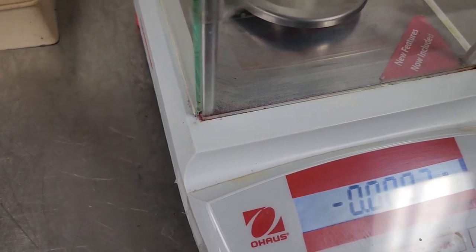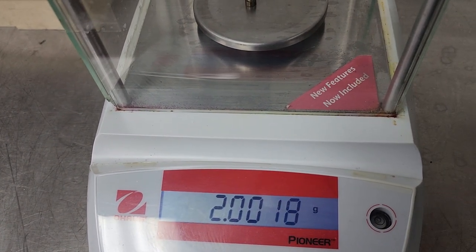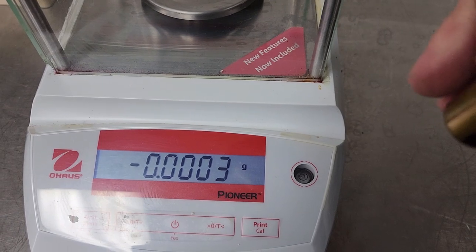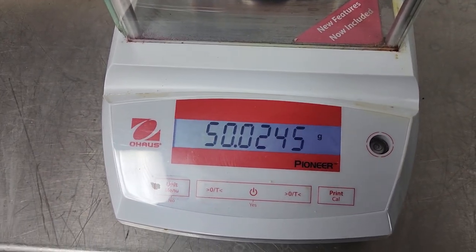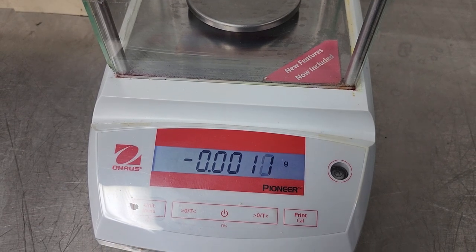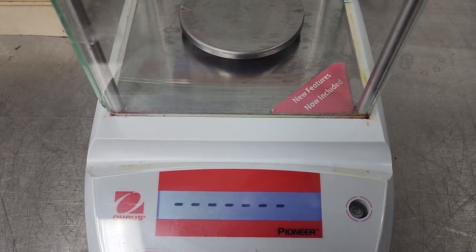and I believe this one is a 5. Maybe that's a 2. That's a 2. And then, I mean, we can go up to, let's say, whatever this one is. 50 grams. And that all seems to work. It looks like it might need to be calibrated or at least set up, because that isn't right.